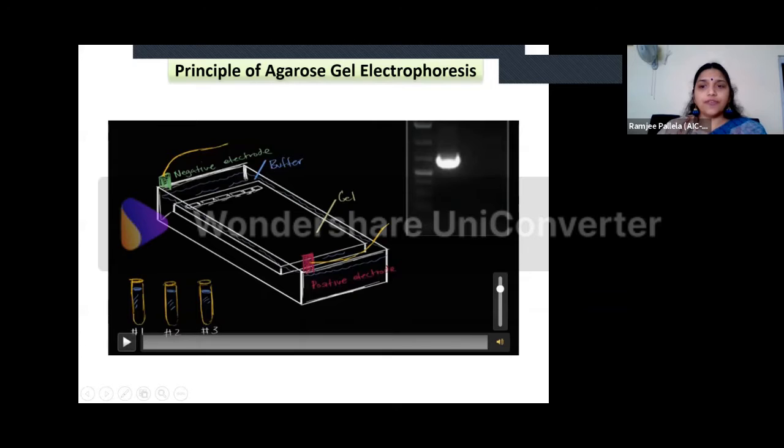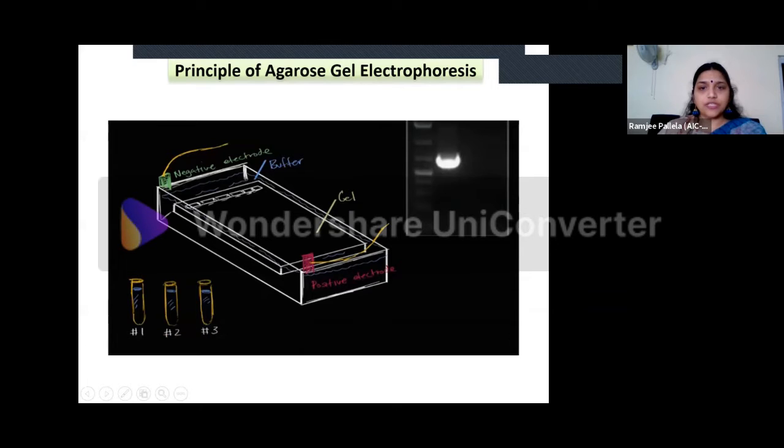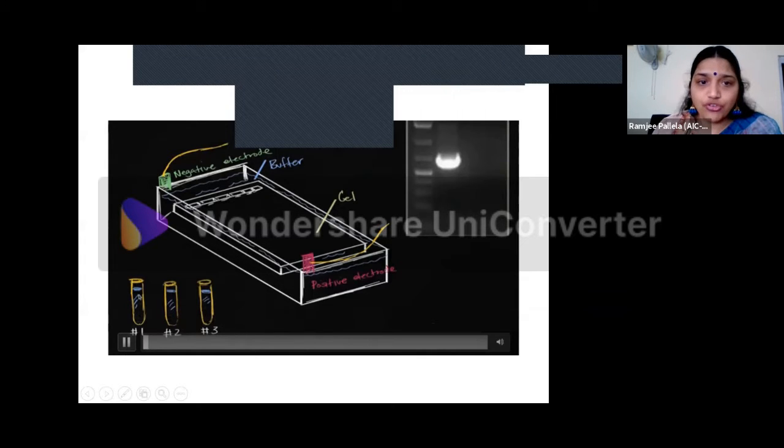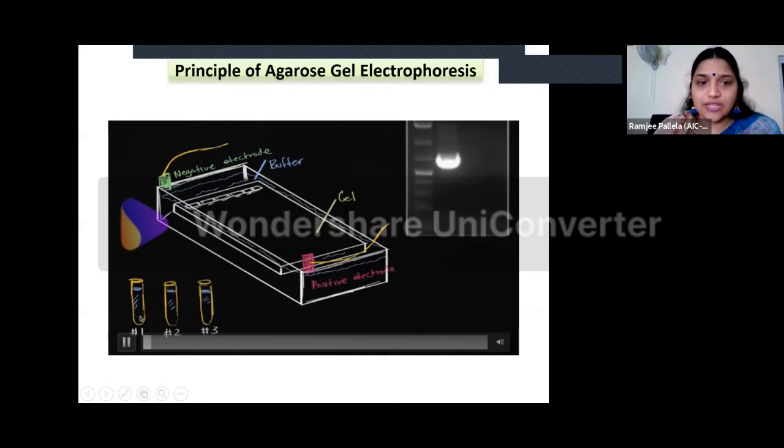Let us first see the principle of gel electrophoresis. Although Madhvi ma'am has told you yesterday, it will be good if I reiterate it. There is a gel chamber, and in the gel chamber there will be a negative electrode, a positive electrode, and a buffer chamber, and this is the gel, you can see it here. Then there will be 1, 2, 3 samples.